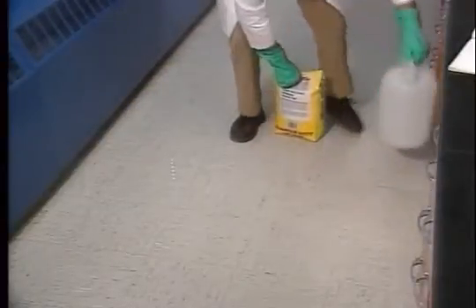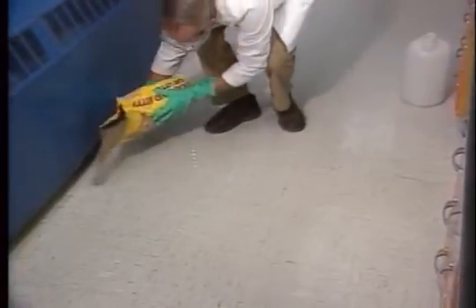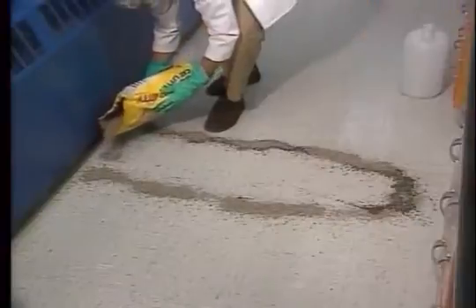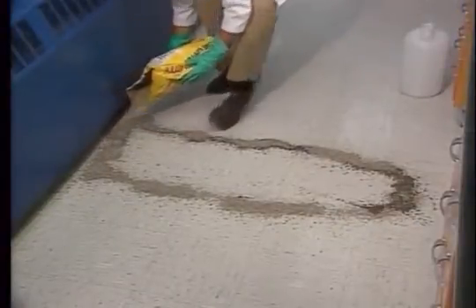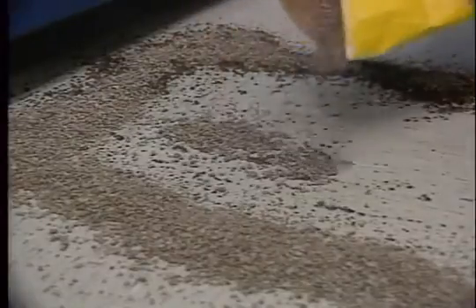At some point in your laboratory work, you'll probably spill something. You should report spills immediately. Stay away from the spilled chemical and let your teacher clean it up. To keep a large spill from spreading, it's barricaded with an absorbent material such as kitty litter. It's then either mopped up or covered over completely with the absorbent.